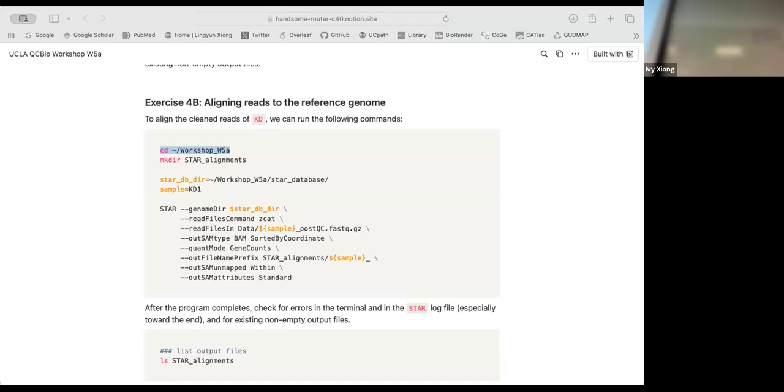The way I made it, I didn't have a .gz at the end because my initial files didn't have a .gz. So you can decompress it and try again. Or does it have to be zipped? Either you don't use the .gz, or you delete it.